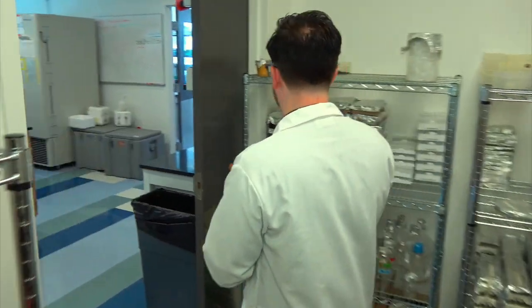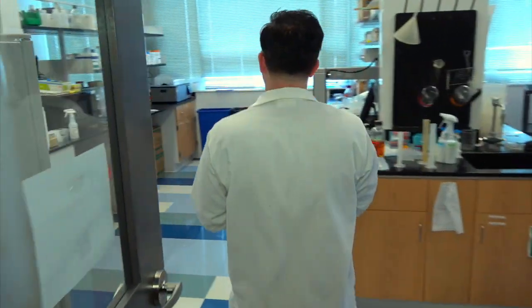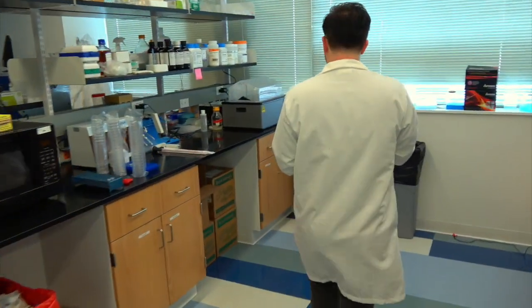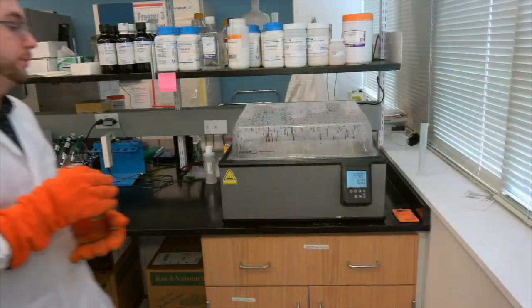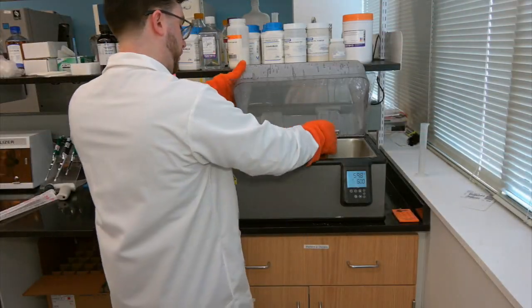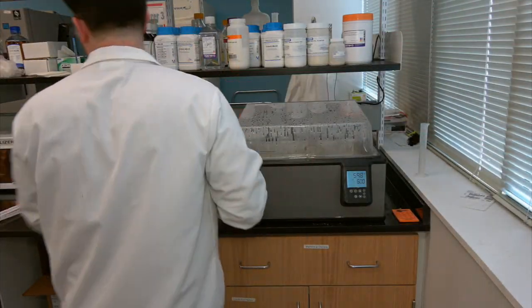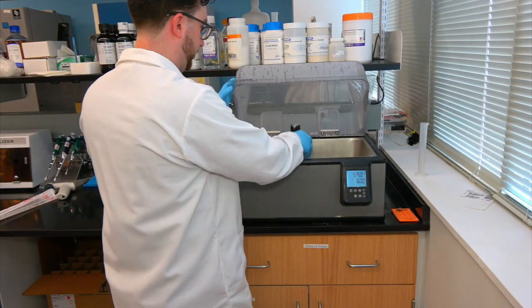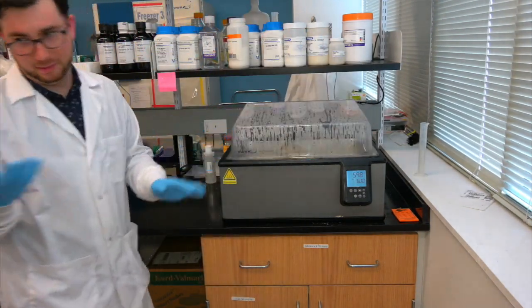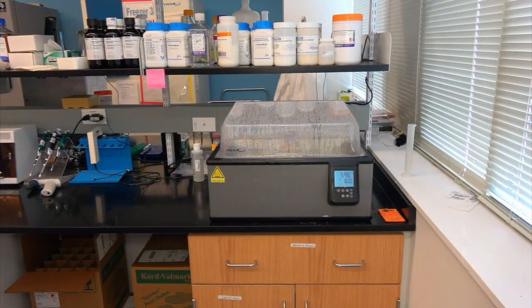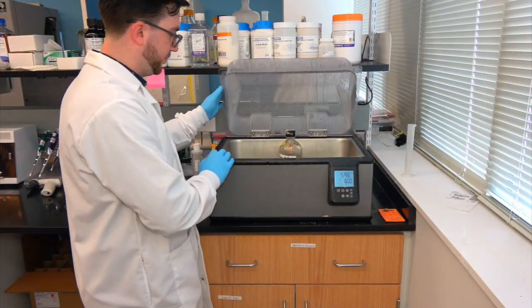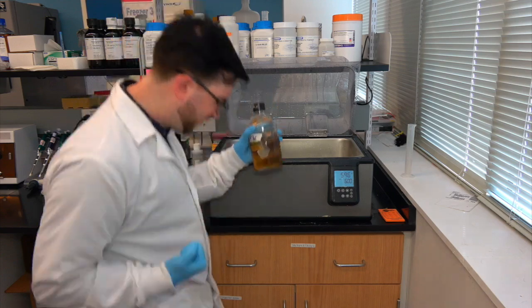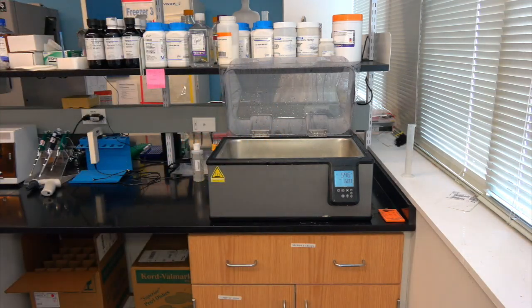Next, we place the bottle with the molten LB agar mix into the 60 degrees Celsius water bath, submerging about 75% of the bottle. Be careful not to let any of the water bath water touch the lip or the top of the bottle, as this water is not likely to be sterile. After at least 5 minutes, we remove our molten gel mix from the water bath. As a good rule of thumb, if you can hold the bottle with lab gloves, it's likely cool enough to add antibiotic. You can use a laser thermometer for a more accurate temperature measurement.